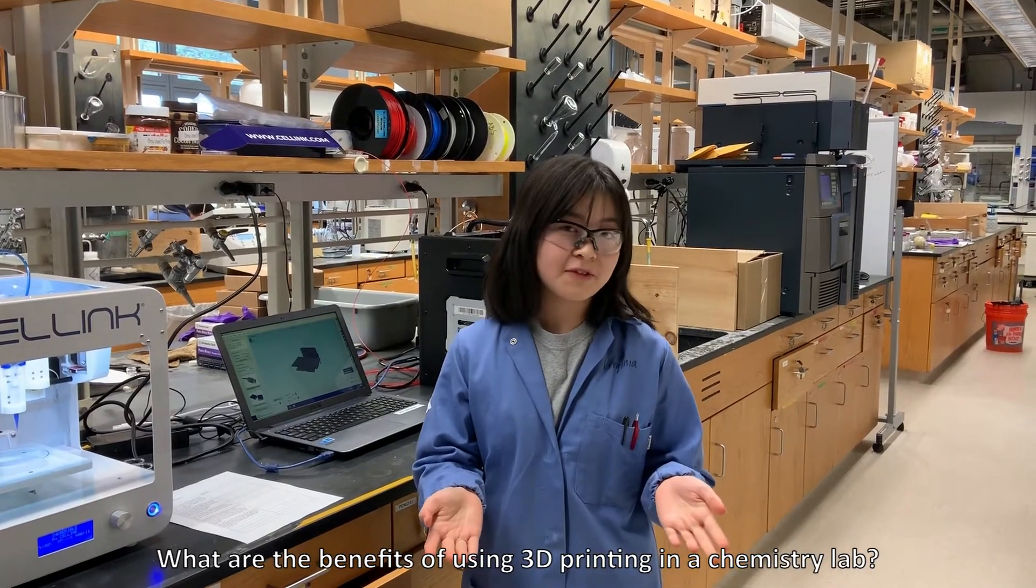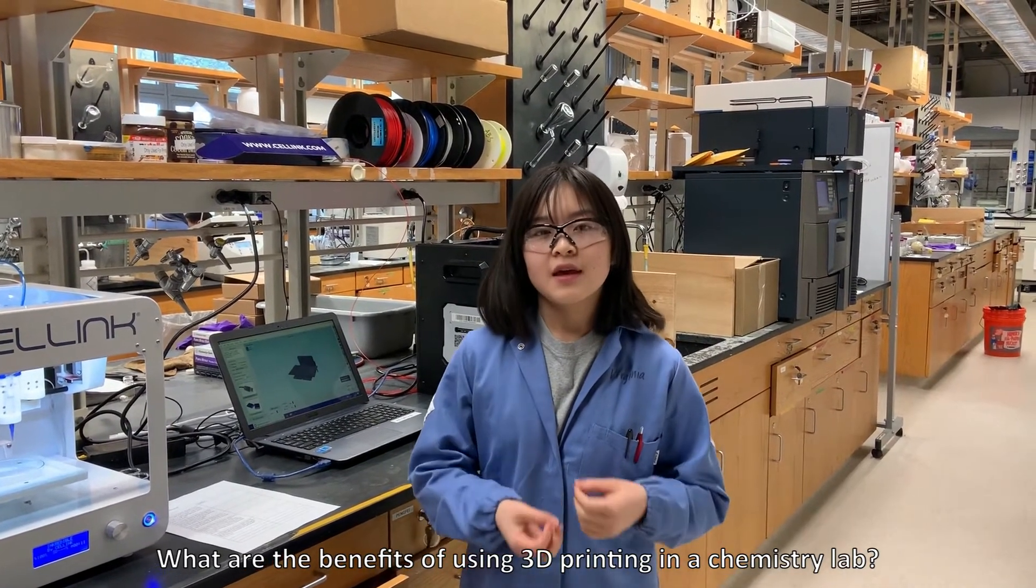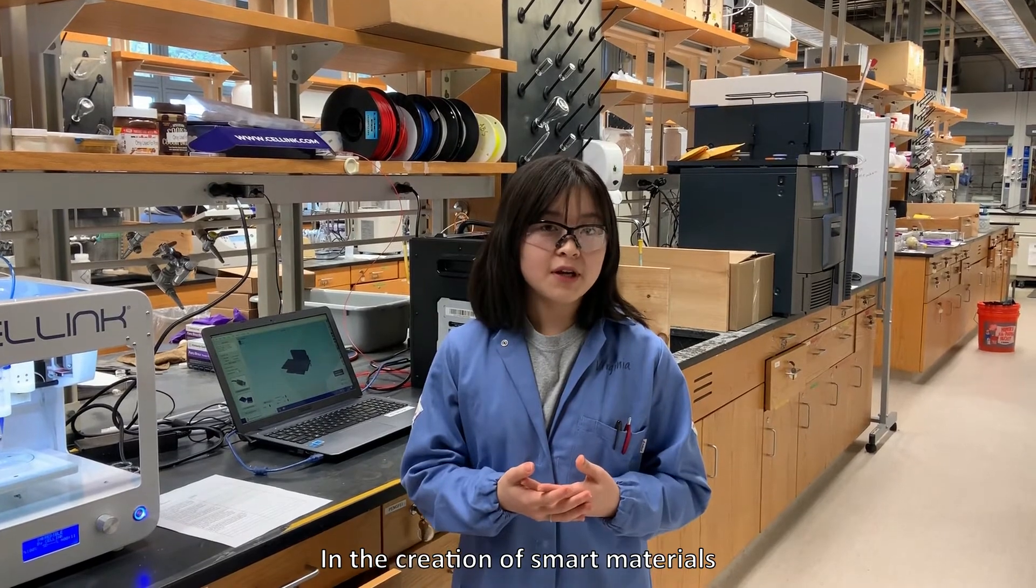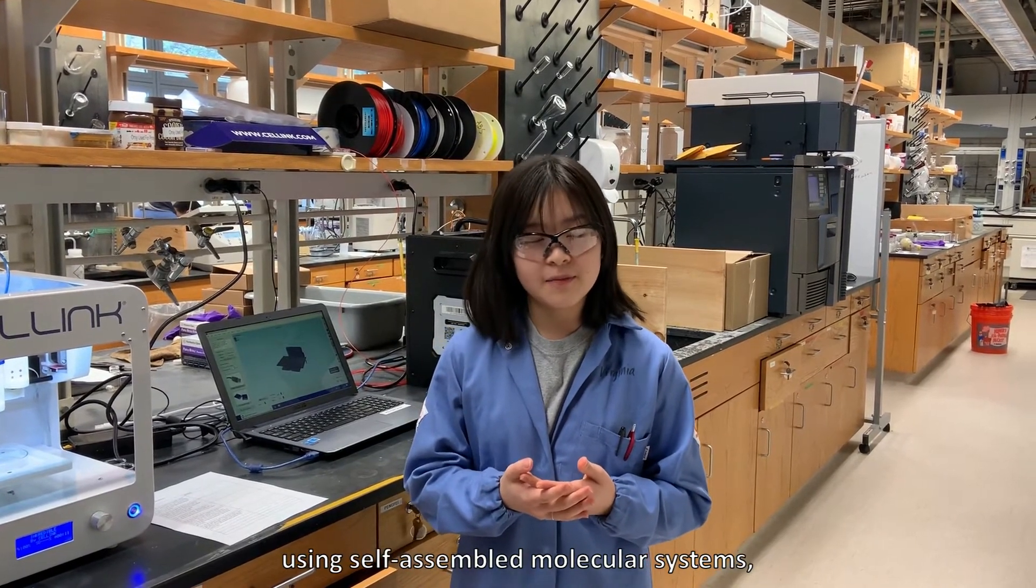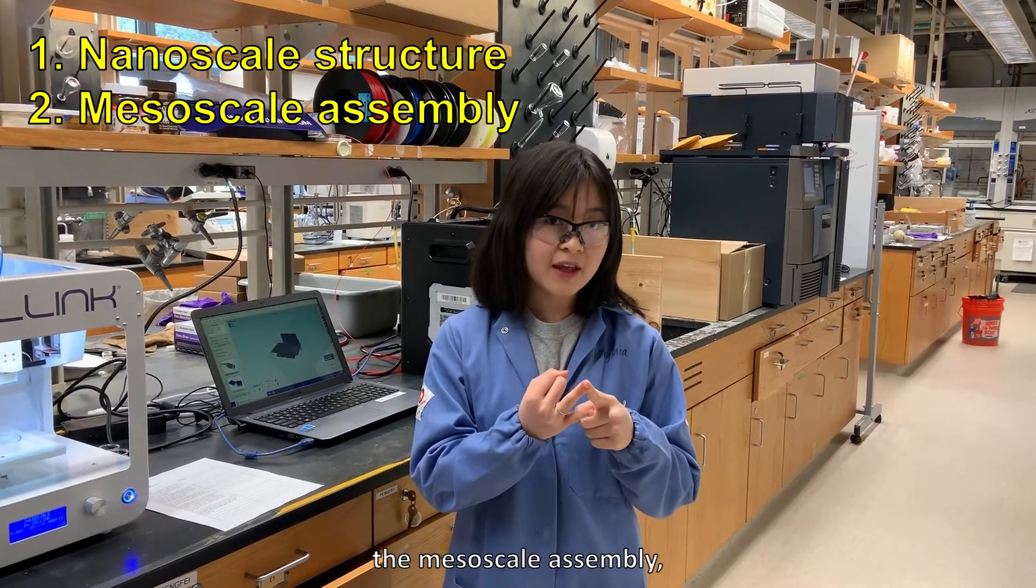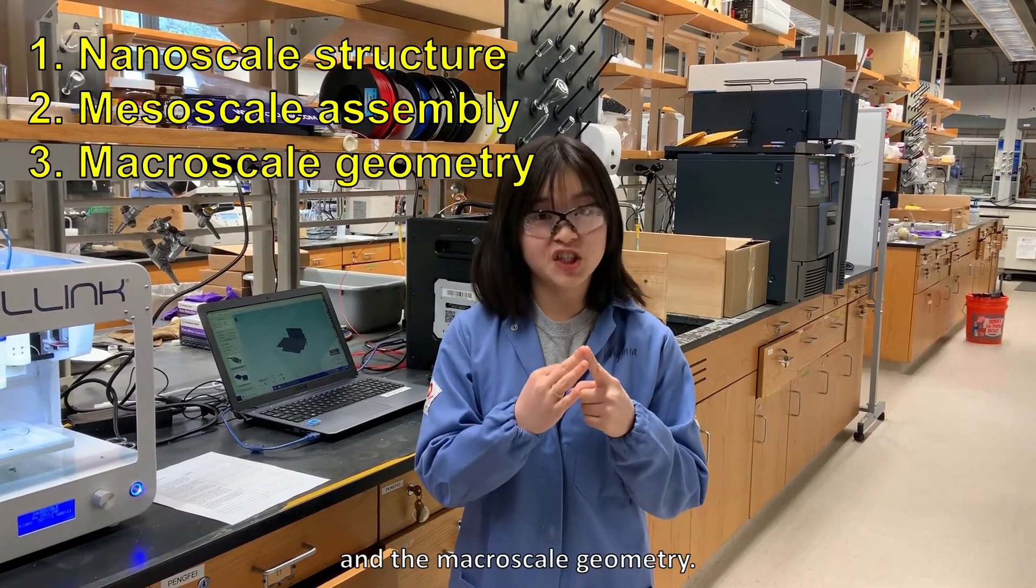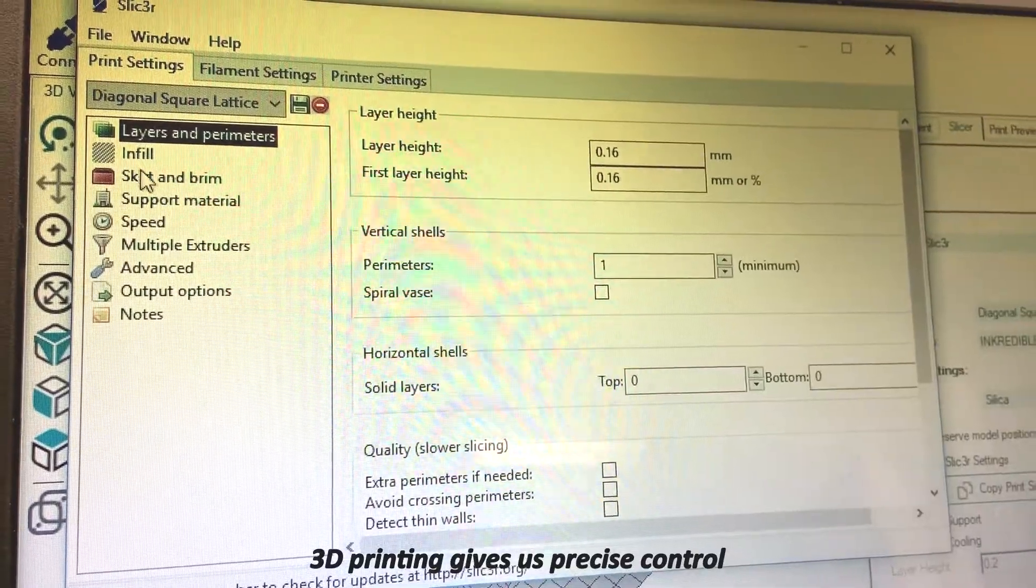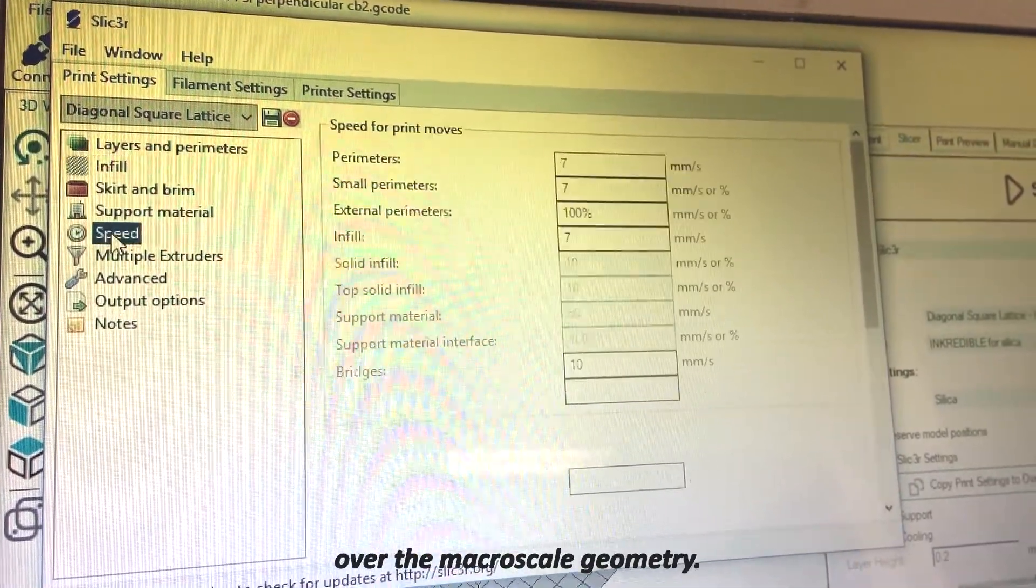What are the benefits of using 3D printing in the chemistry lab? In the creation of smart materials from self-assembled molecular systems, there are three things that need to be controlled: the nanoscale structure, the mesoscale assembly, and the macroscale geometry. 3D printing gives us precise control over the macroscale geometry.